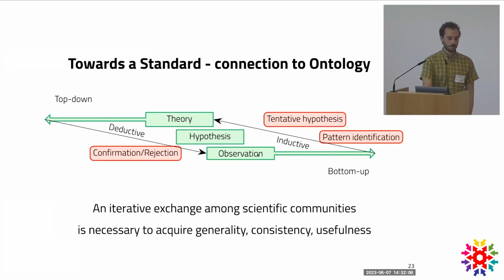We start from the observation of single use cases and of their data sets. With a kind of inductive process, we design a data model, so we go to the theoretical description of this data. From this, we have a data model in our bag that we can use to readily describe new use cases that are coming. But this process is also connected to the initial part, because every new use case gives some new insights to my data model, extending its power, let's say.